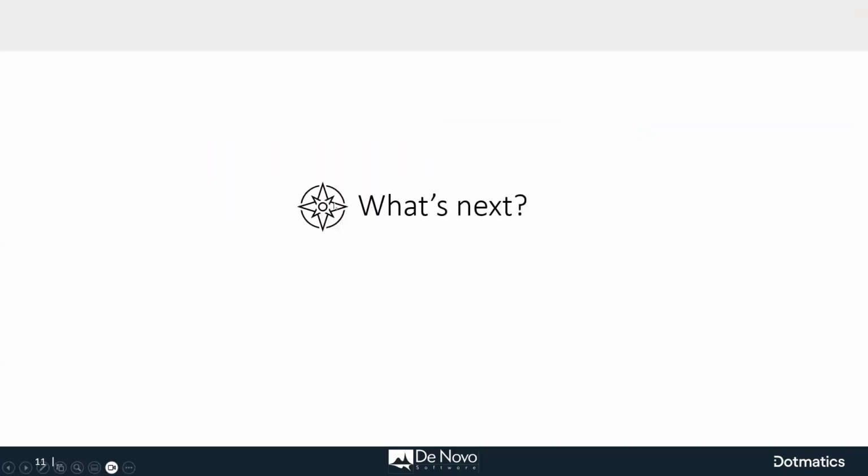More things on quadrants again tomorrow, but I really like this one, so I wanted to provide you a preview. What's next? These are my last few slides, and then I will have a look at questions in case there are any.